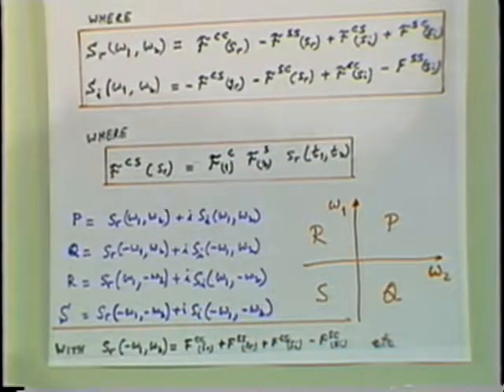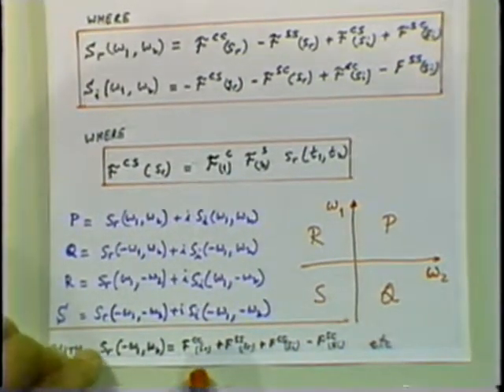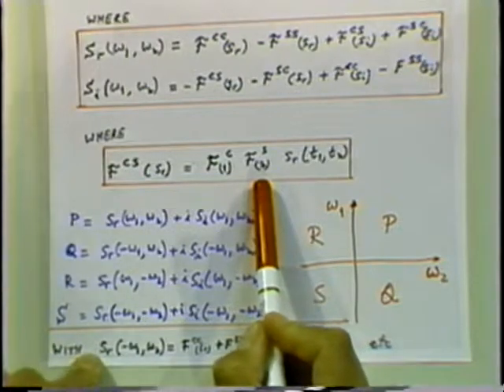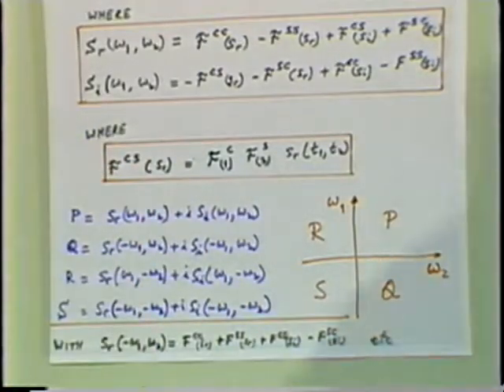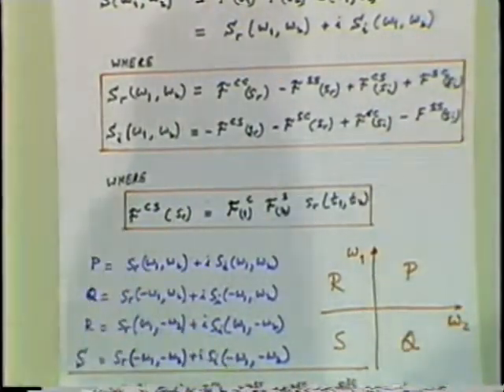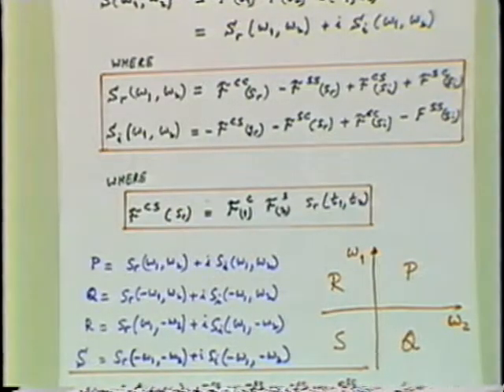There is a notation here, in which the first cos refers to the omega 1 or T1 domain, and the second refers to the omega 2. One has to be a bit careful with this, because if we again write 1 and 2 here, it becomes too much. So we just follow this: first one first, second one second. Simple. So this is basically what we have about how we collect time domain data, how we process it, and what kind of line shapes we get in two-dimensional NMR spectroscopy.